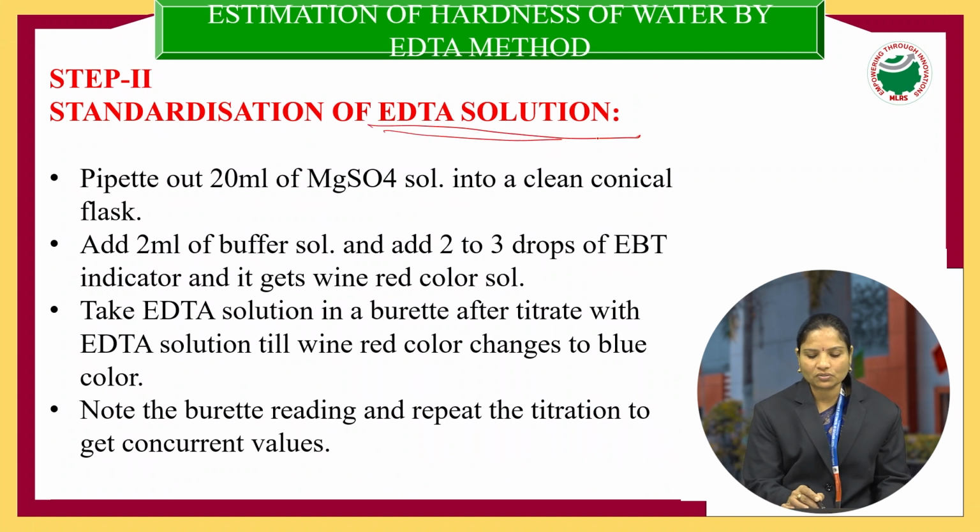Then go to step 2, standardization of EDTA. Actually this is our experiment. So here we are using our EDTA solution. Fill the burette. Actually this is a standard solution. So fill the 50 ml burette with EDTA solution.